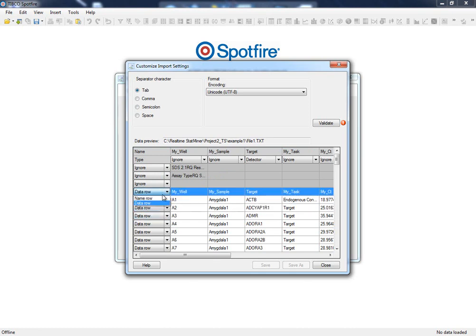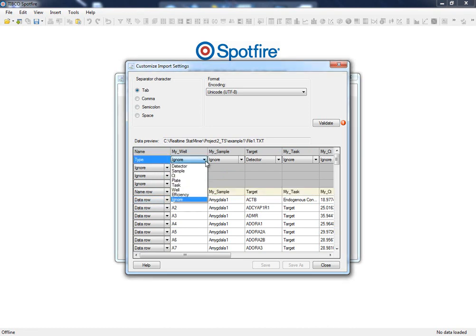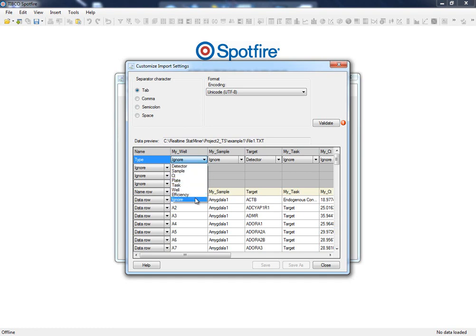Now we can select our information of interest. To do that, each column in the preview has a list box which allows us to determine the information provided by that column. In case the column doesn't play any role in our analysis, we should inform StatMiner to ignore it.